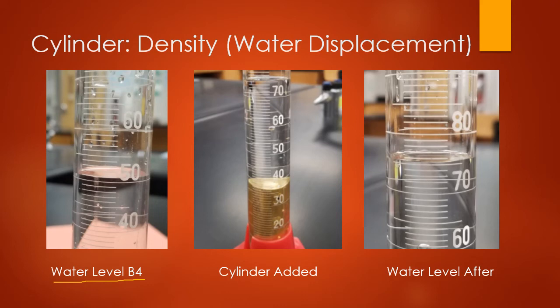But just like the ruler, you don't want to approximate. You want to go one further than the device allows. So this device, this 100 milliliter graduated cylinder, goes by ones, right? 51, 52, 53, 54, 55, all the way up to 60. So if it goes by ones, you want to go one further, which means you want to go one decimal place out when you're recording the initial volume. And I'll leave that decimal place for you to decide what value should go there.